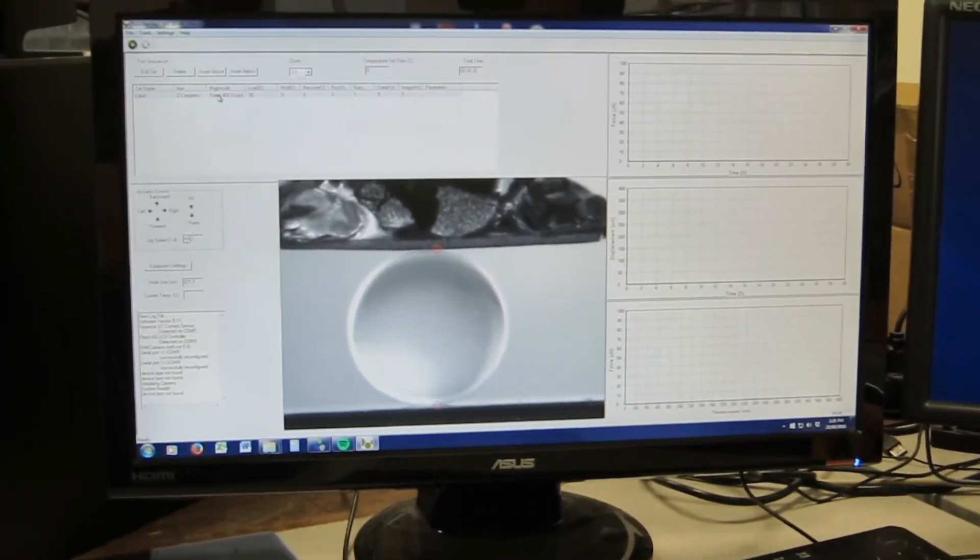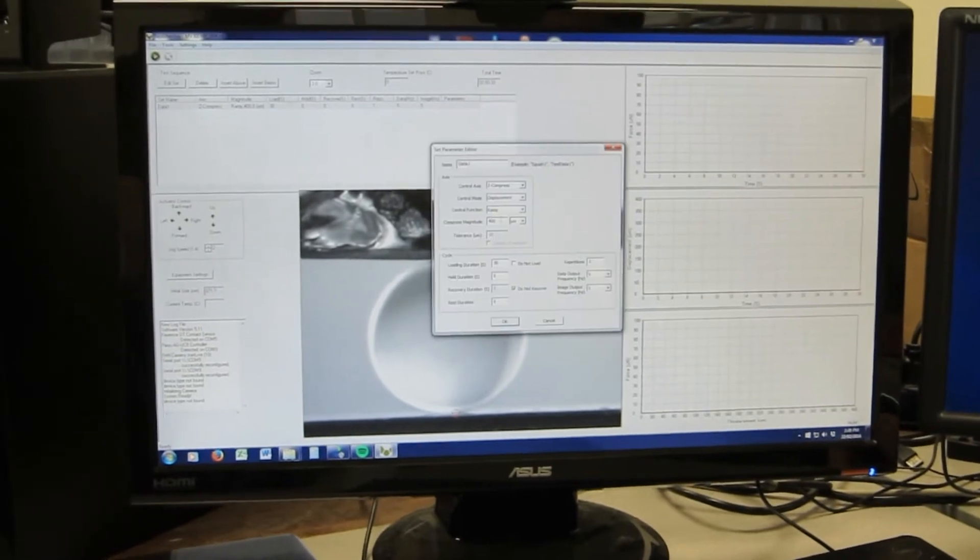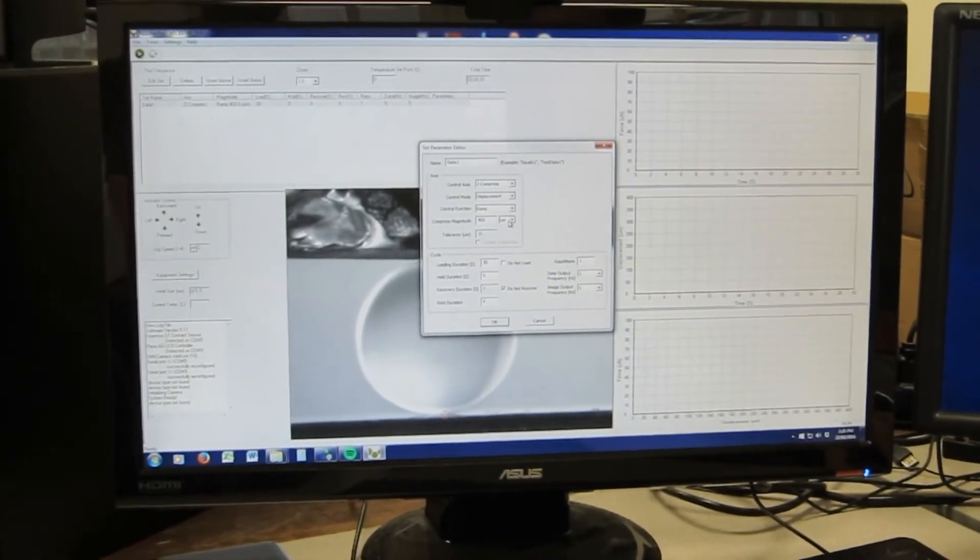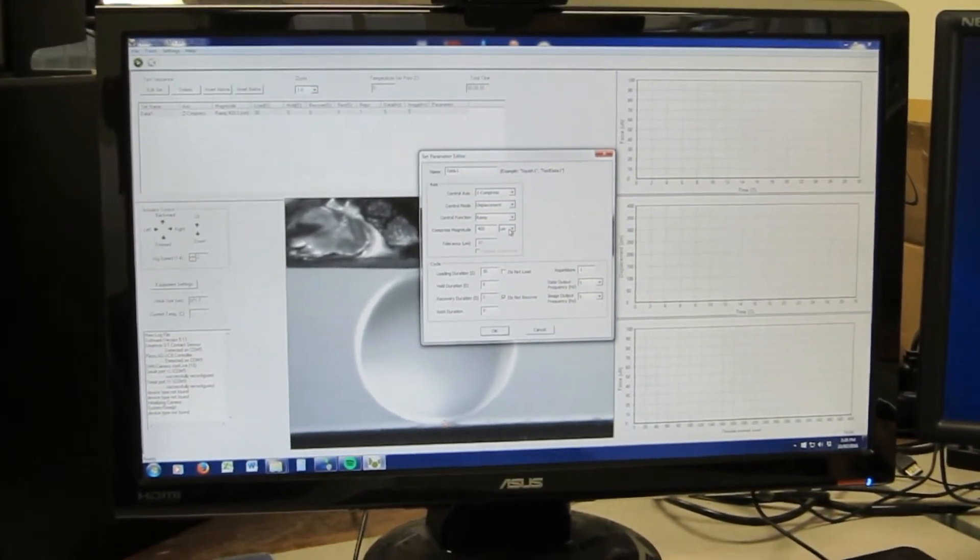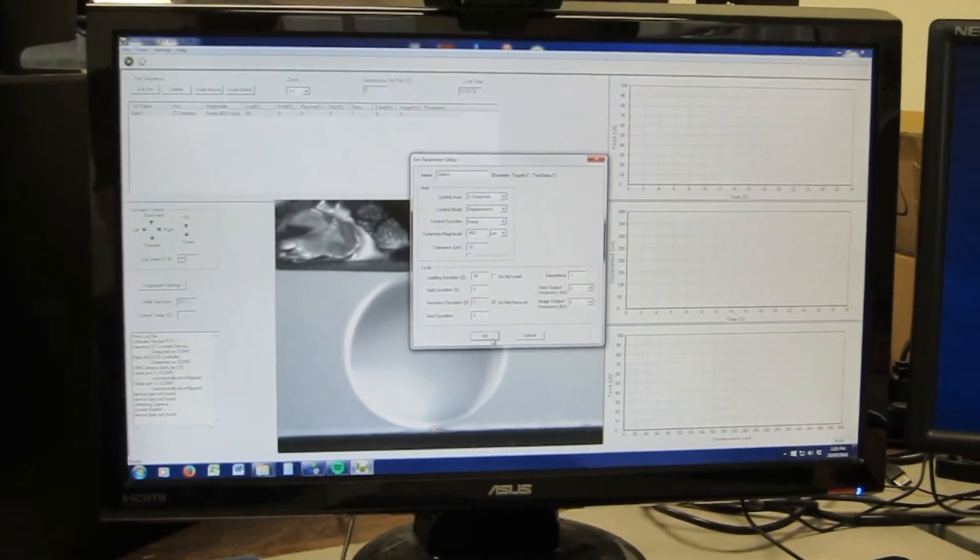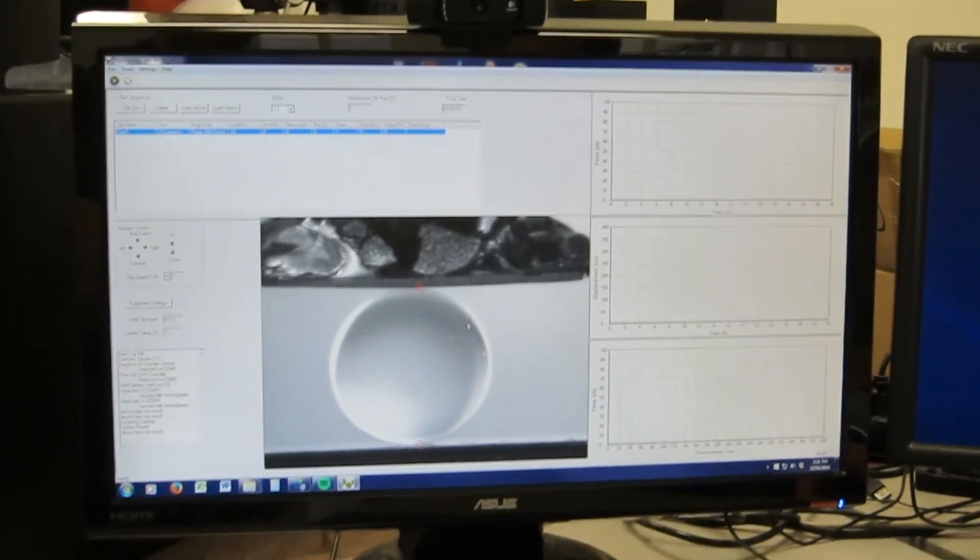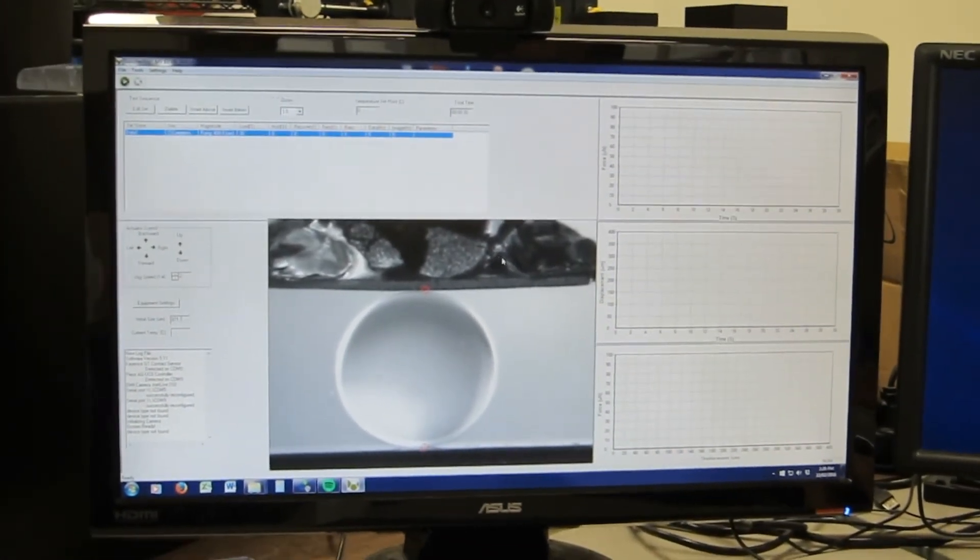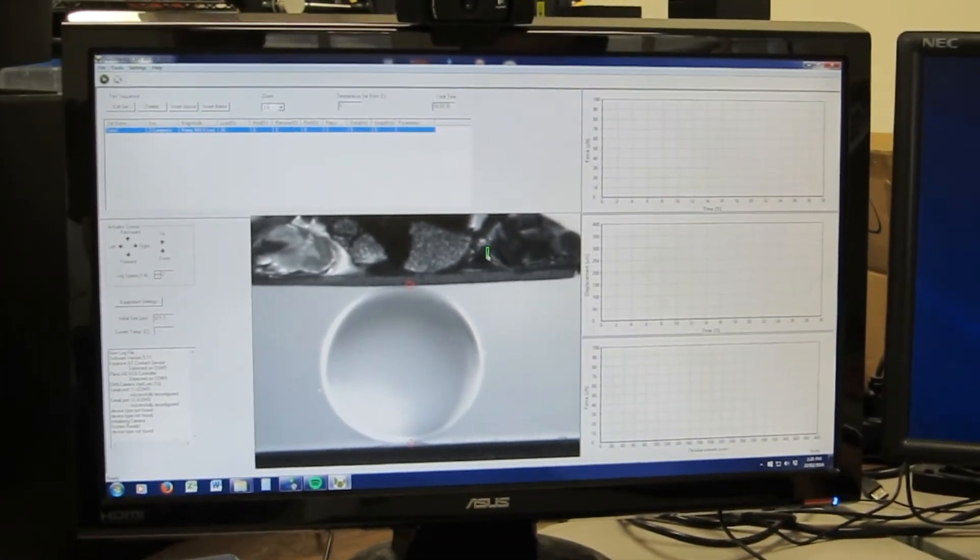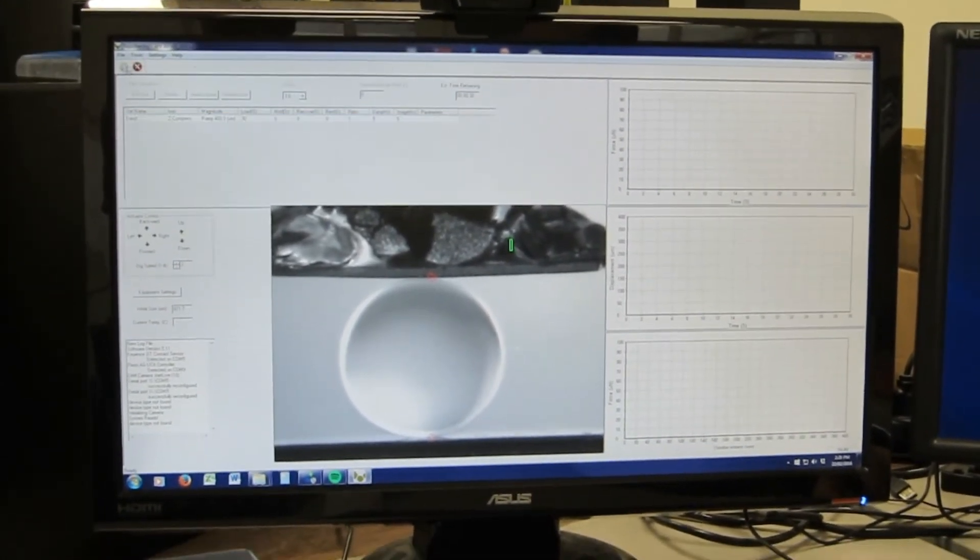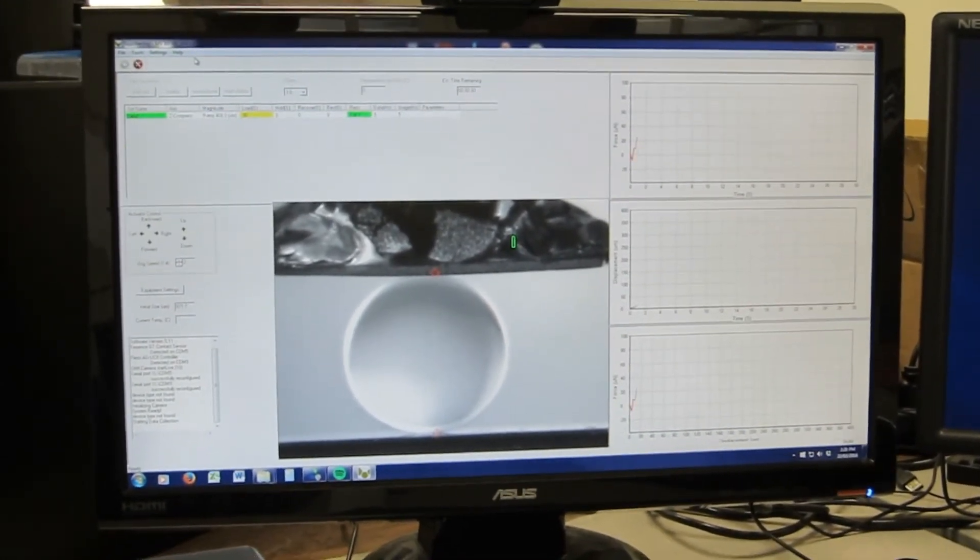I've set up my test protocol to do 400 micrometers of displacement in 30 seconds. So I'll just select a tracking point that's part of the moving surface and start the test.